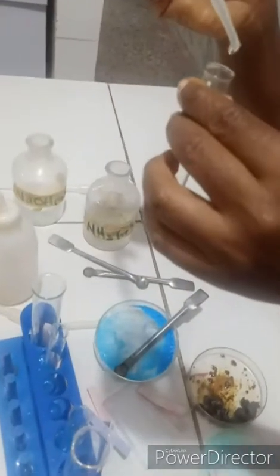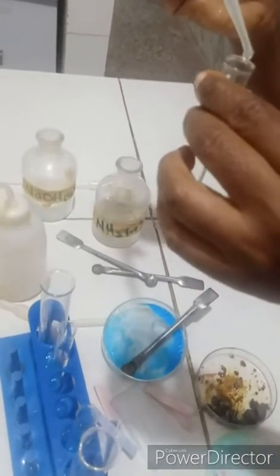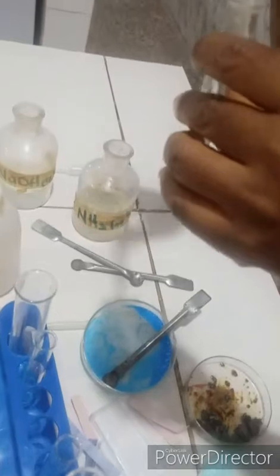You can watch me. I'm using my dropping pipette to add in drops. 2 to 3 drops is okay. You can also see the formation of a pale blue precipitate. The inference also is that copper 2 plus is present. Now in excess, remember I said when we add reagents in excess, we want to check whether the precipitate will dissolve or not.